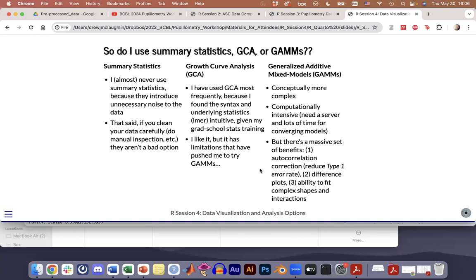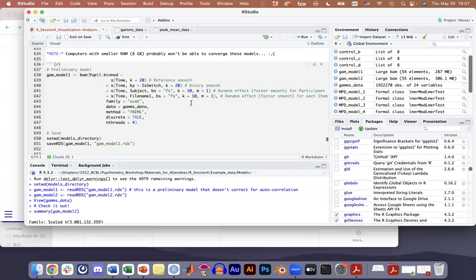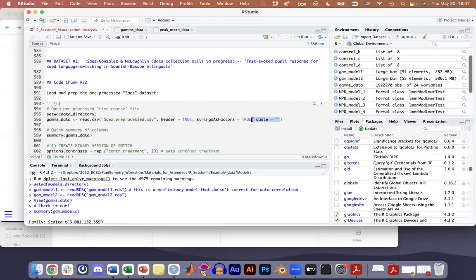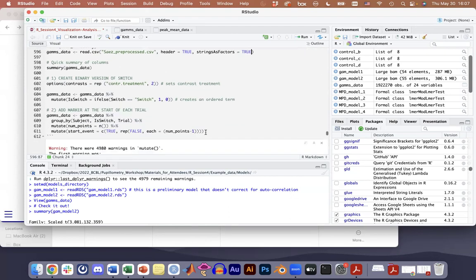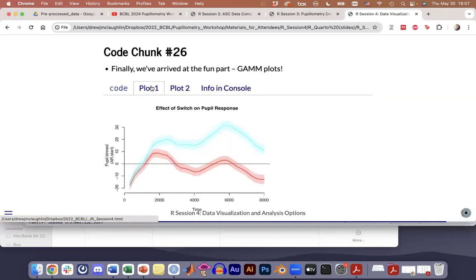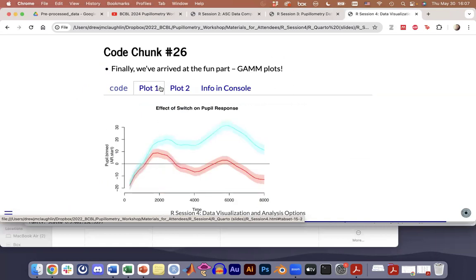Questions first? The thing that I said, it reads it weird and it's giving a different answer. So I would suggest not. Let me scroll up here. X-nay on the quote A, that did not work. So apologies to PC users, something about the data set was not prepared well for your computers. You should still be able to, with the PowerPoint, come through and look at what you should have been able to get. So you can backtrack and look at that.